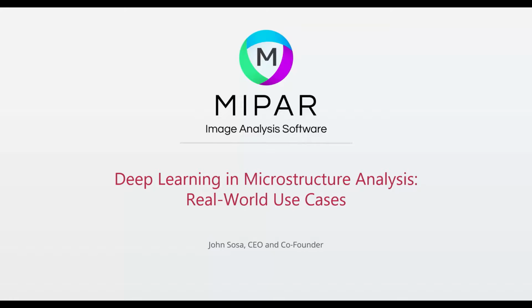So today is going to focus on the use of the latest in deep learning AI tech, specifically how it relates to solving some of the more challenging but often commonly encountered practical problems in microstructure analysis in materials. We introduced deep learning into MIPAR back in around July of last year, and it really has had a profound impact on the types of problems that we can reach with the software and the accessibility of those solutions to the everyday user.